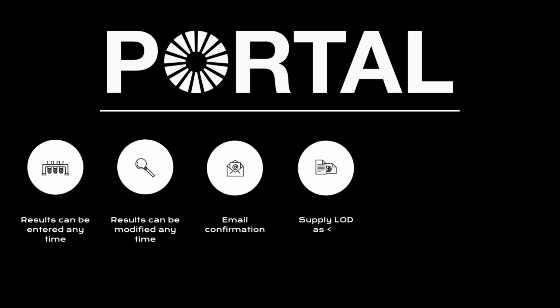So let's recap the key points for result entry. Results can be entered at any time during the round. You may modify your results at any time during the round. And once results are saved, you will receive a result confirmation email. If you cannot supply a quantitative value for a quantitative analyte, please supply your limit of quantification or detection value as a less than value, where the value is your numeric limit of quantification or detection.